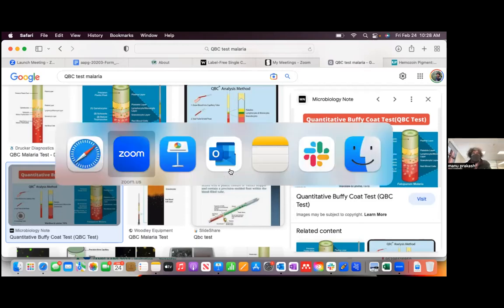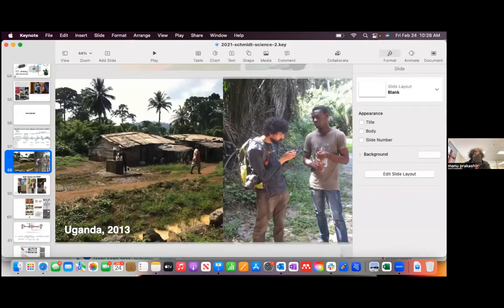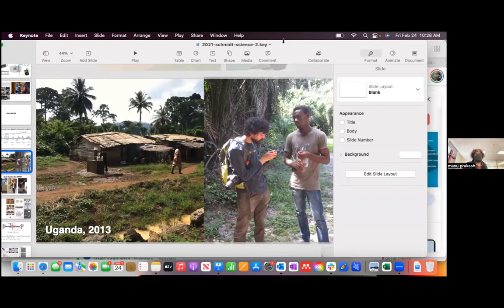But the problem was most of the time when we were out in the field, we would see this as one of the field clinical conditions. So we're operating in a place where there's no electricity. Although I think this is a fantastic centrifuge, you have motors, it's sealed. If you don't have electricity, it's a door stopper or something else. It's not a centrifuge, right?